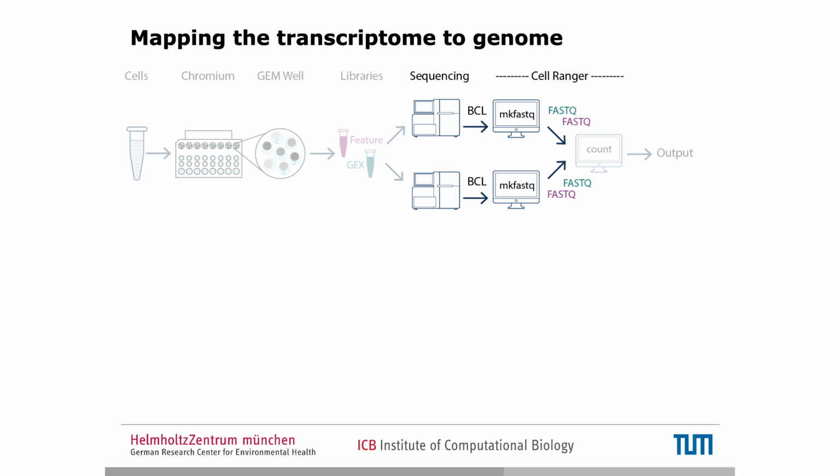FASTQ files are huge, so you shouldn't store them on your laptop. Rather use a storage unit.